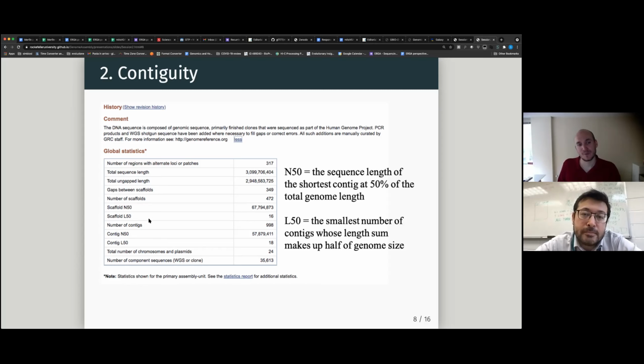Because of course in here they've constructed the entire chromosome, so you would expect that to be the case. So that would be considered perfect, right, if you reach the size of the chromosome? Correct. It cannot be more than that. The problem is that you may reach the size of the chromosome and have the sequence wrong anyway. But that's the idea.